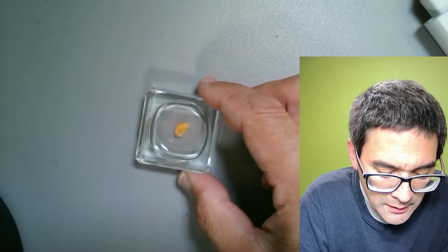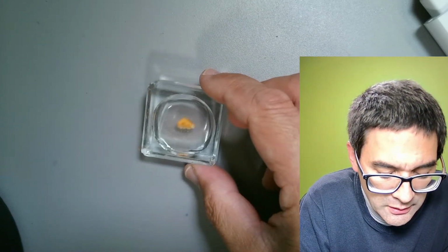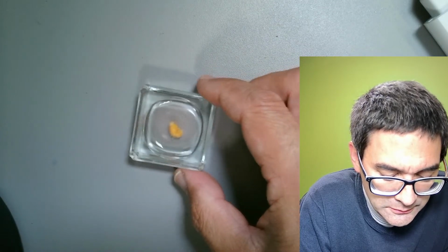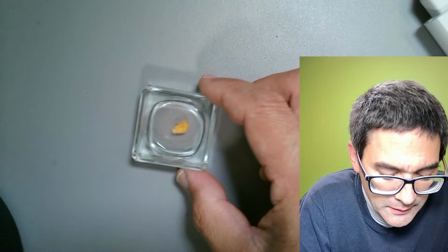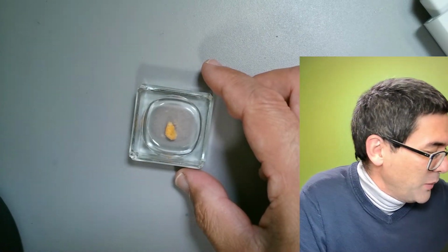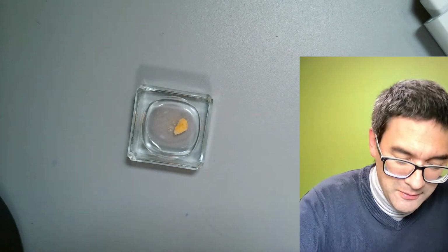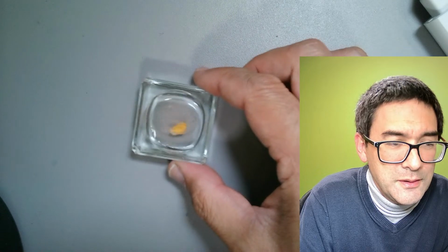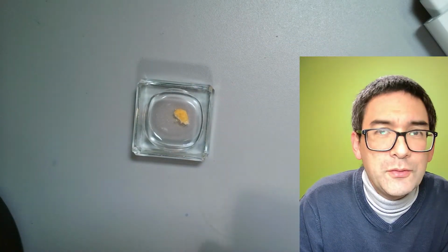And I'm not quite sure whether the water will actually dissolve it sufficiently. Otherwise I'll have to add a little bit of this cracker, of the chip, and then we'll see what's going to happen. I know this is not a very, how do you say, systematic way of testing this, but we'll give it a try. And it starts to slowly swell up a little bit. And then let's put it under the microscope.